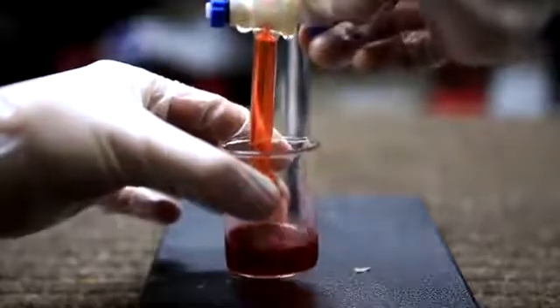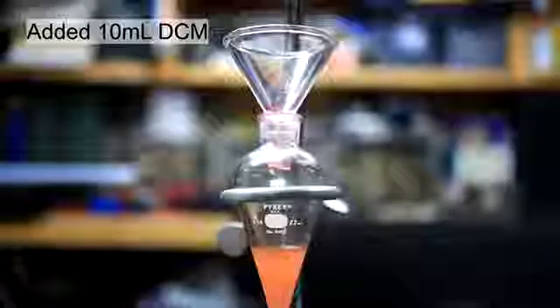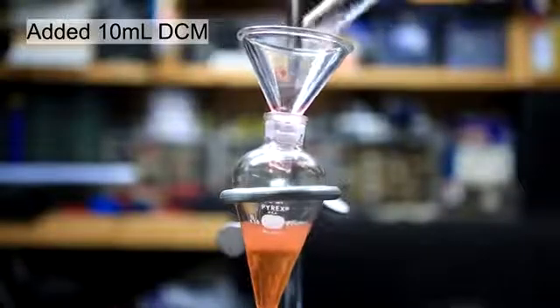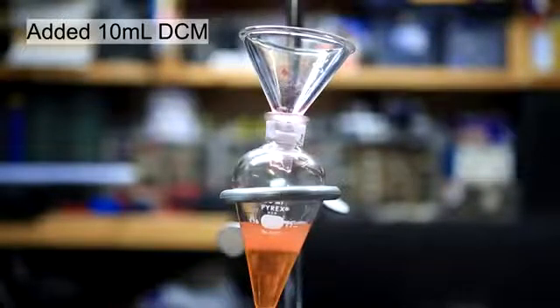The lower layer containing our desired product phenolphthalein is drained into a beaker. Then, 10 more milliliters of DCM is added to the aqueous layer in the separatory funnel. Again, the separatory funnel was capped, shaken, and vented, and then the layers were allowed to separate.